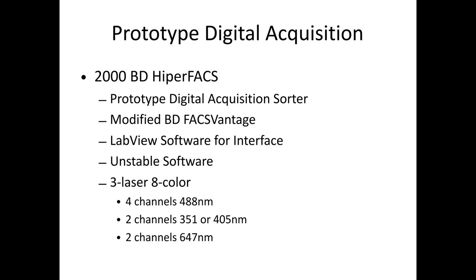We were now getting into the land of digital. And we started to notice some very unusual things, especially when you compensated, because the digital system remained true to the math of compensation. So the phenomenon of spreading was never really visualized before in the analog systems. And all of a sudden we're seeing that. And we're like, what is this?